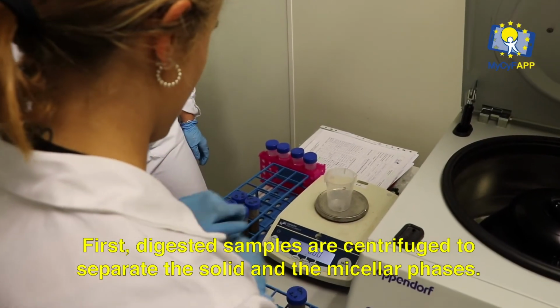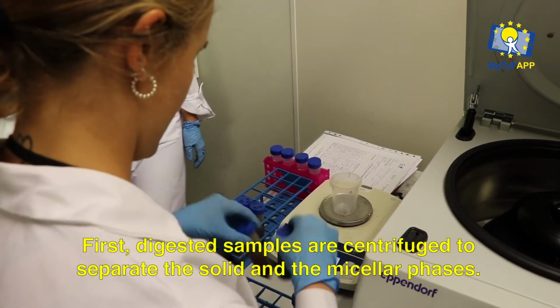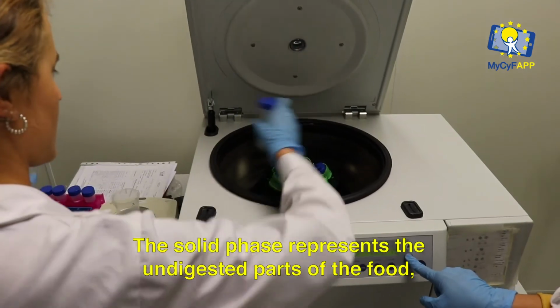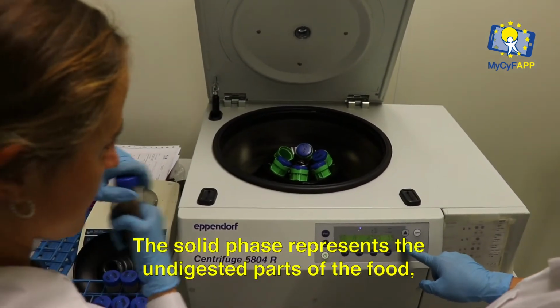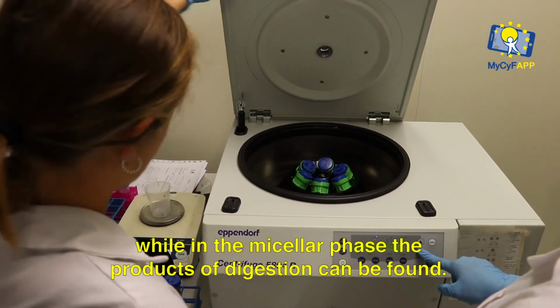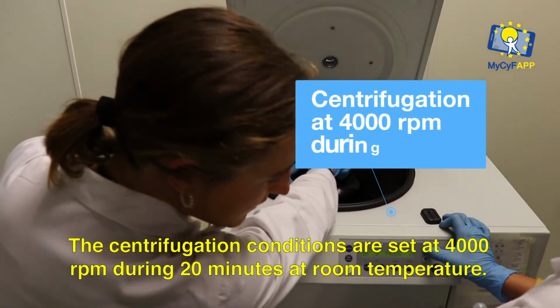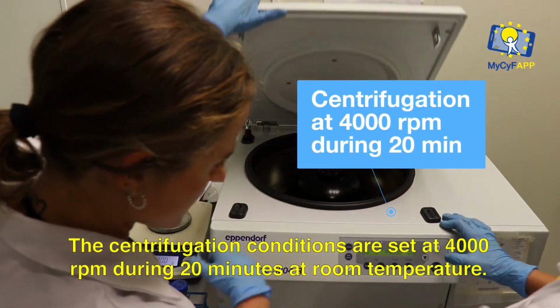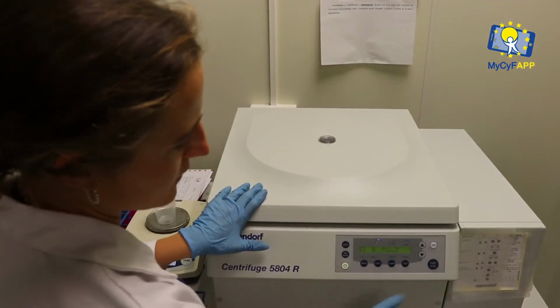First, digested samples are centrifuged to separate the solid and the micellar phases. The solid phase represents the undigested parts of the food, while in the micellar phase the products of digestion can be found. The centrifugation conditions are set at 4,000 revolutions per minute during 20 minutes at room temperature.